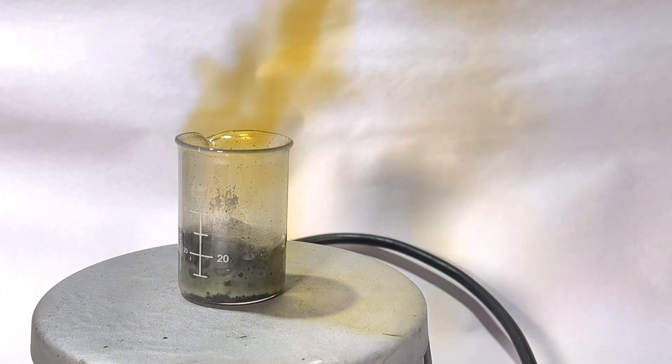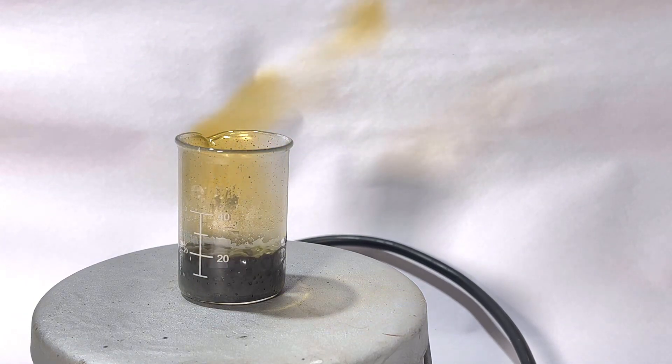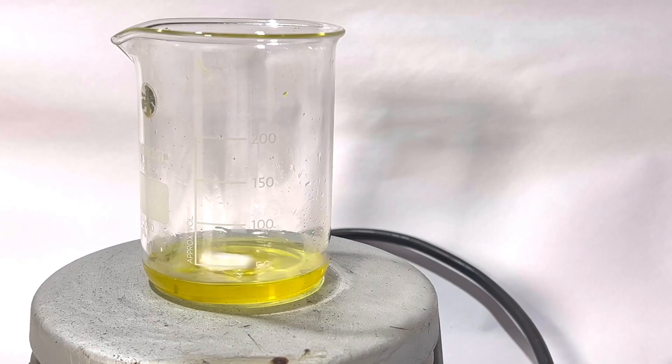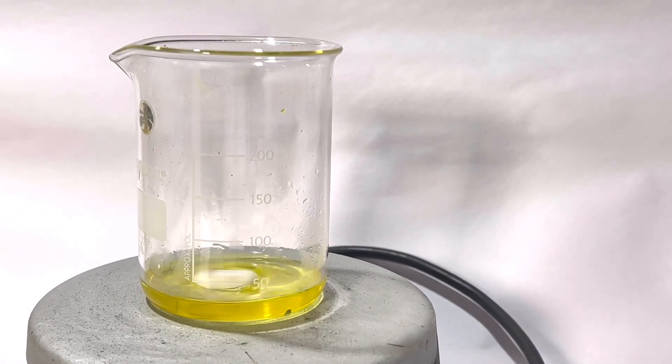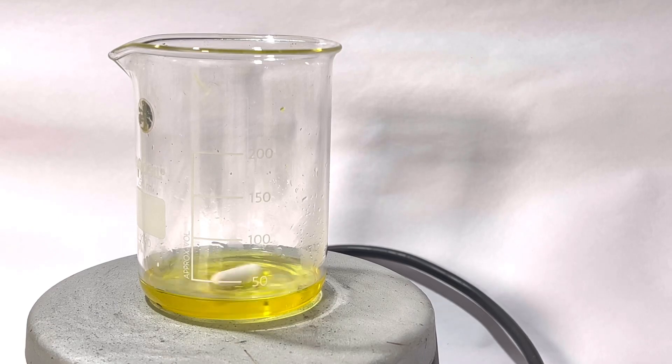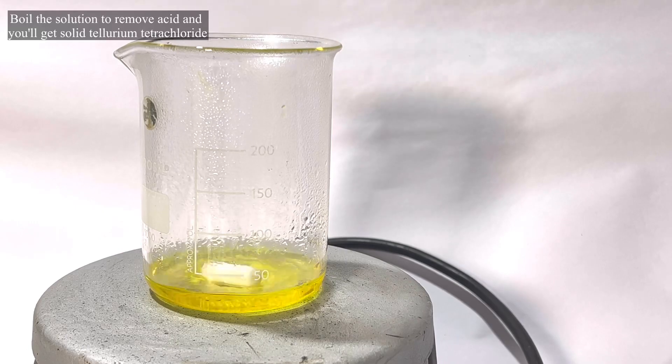Once around 20 milliliters of aqua regia was added, everything dissolved resulting in a clear yellow solution, and this is the tellurium tetrachloride solution. Now this solution was boiled down to get the crystals of tellurium tetrachloride, which will be used completely in the next step.